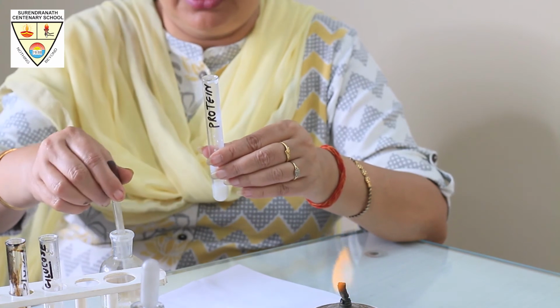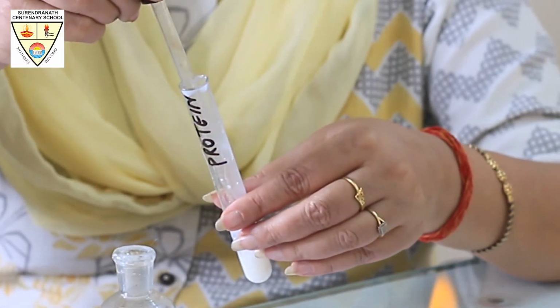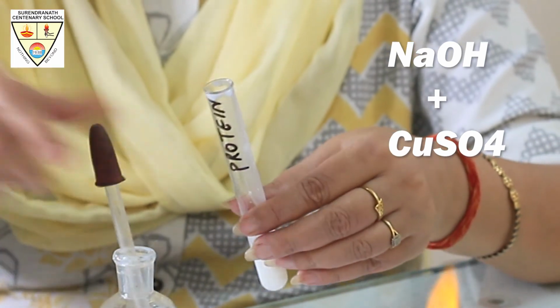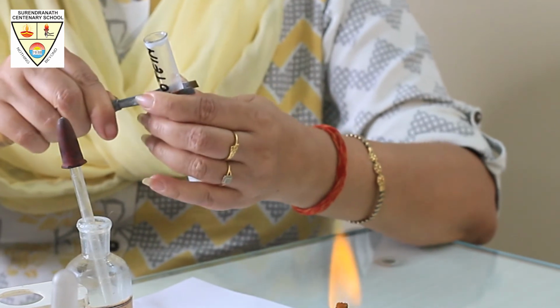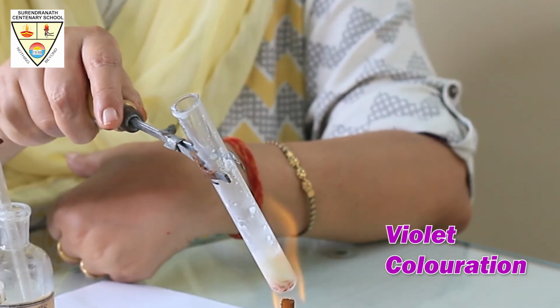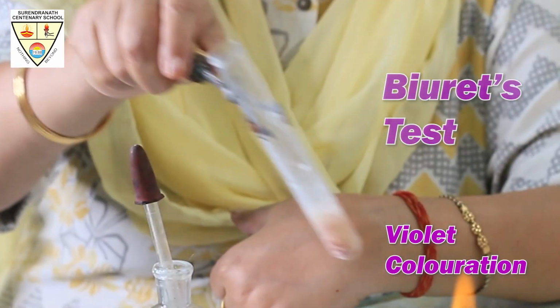We are now going to talk about proteins. Take 2 milliliter of protein in a test tube. To that, you add a little bit of NaOH and a little bit of CuSO4 and boil it. You will find a pinkish red or violet color change in the test tube, confirming the presence of proteins. This test is called the Biuret test.